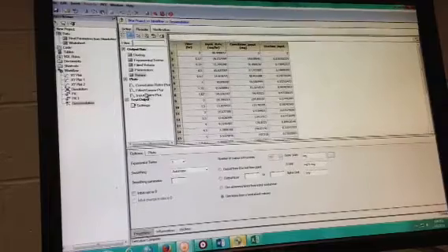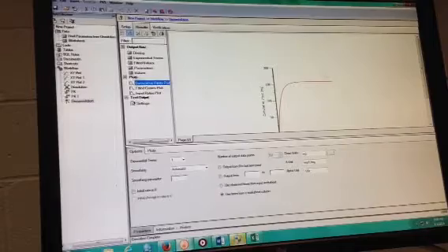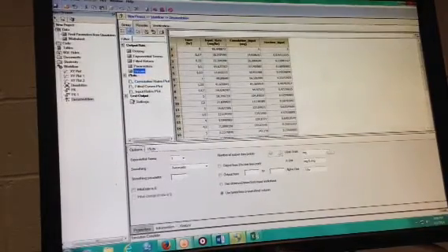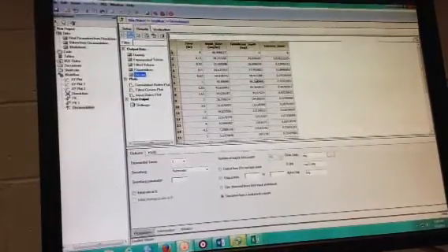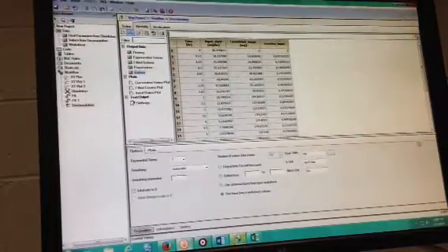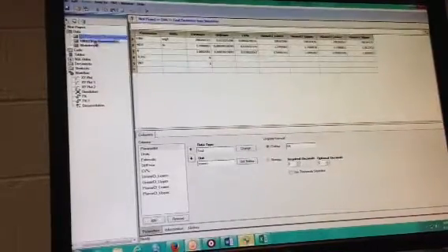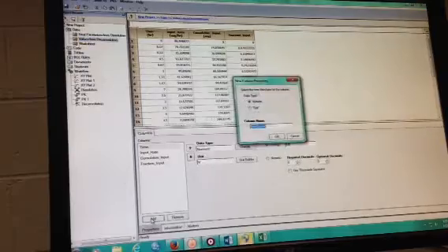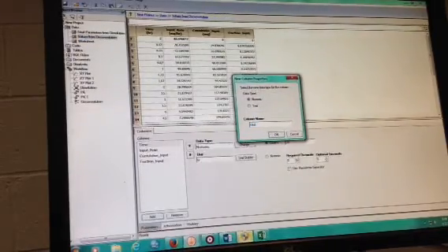So let's see. I get probably something that is identical to what I had before, from this point of view. But the values now are calculated at this time. So if I save it here, then I'm going to save it from the deconvolution. I can add a column. It would be the dissolution.